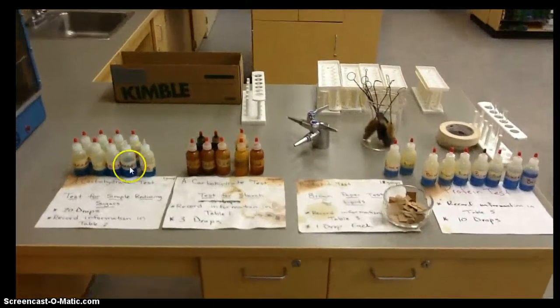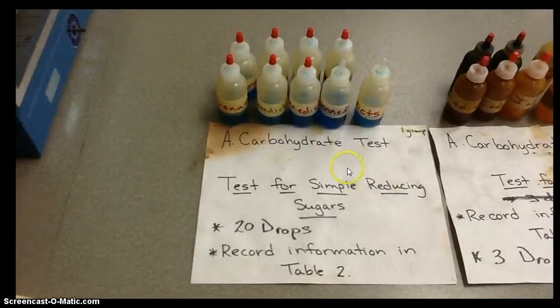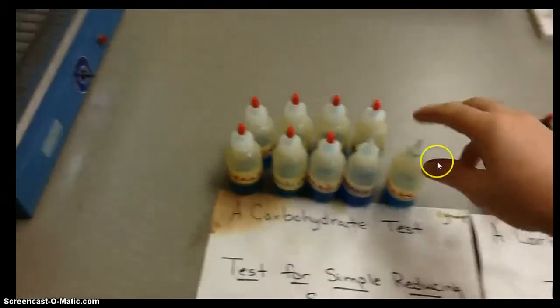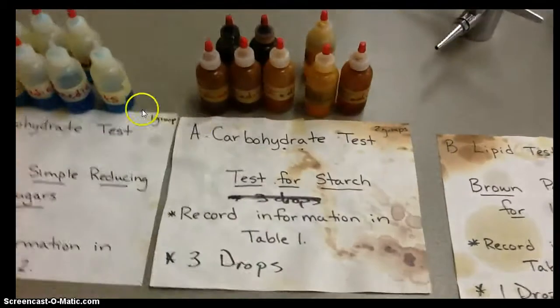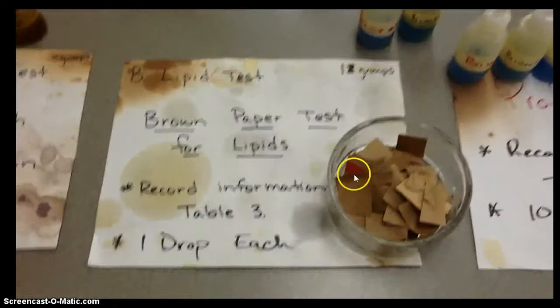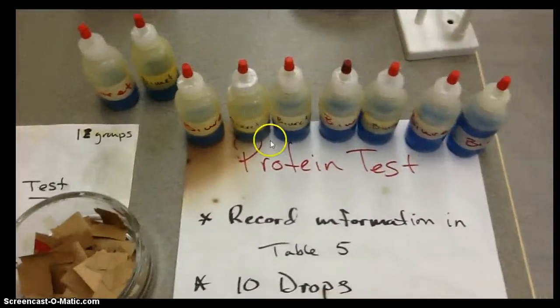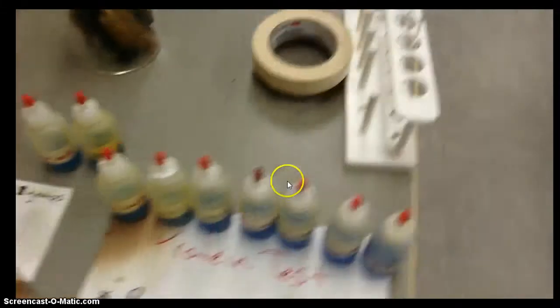Now, here are your reagents that you're going to be utilizing. The reagents are shown here. The carbohydrate test, which is for simple sugars, is Benedict solution. You're going to take a vial and put it on your desk. Carbohydrates is starch. Take a vial and put it on your desk. Some brown paper bag. You're going to take that for your paper smear test. And then finally, biuret solution. You can take that to your table.